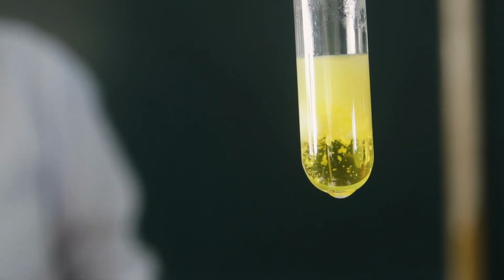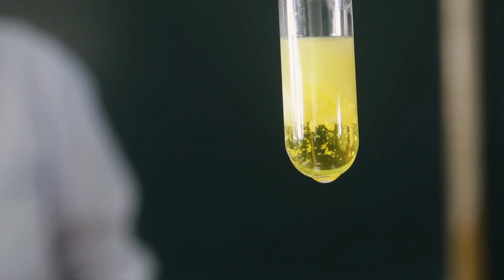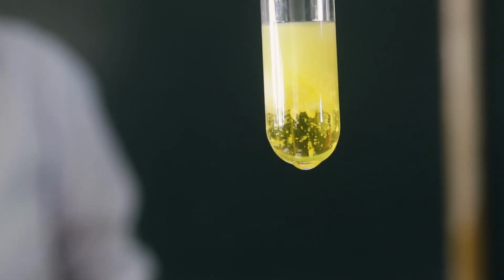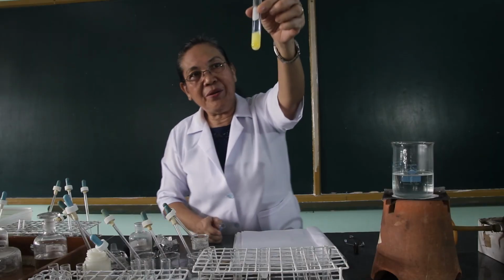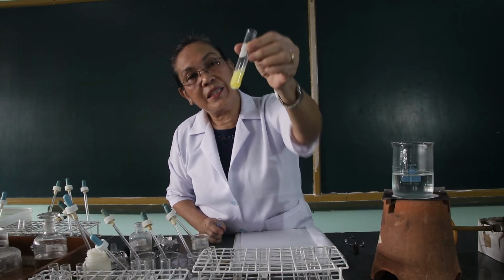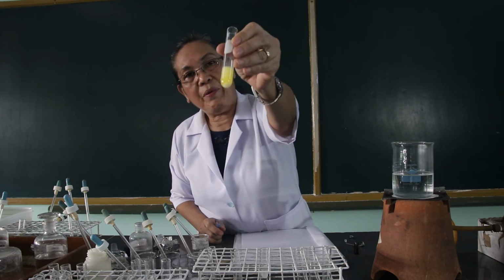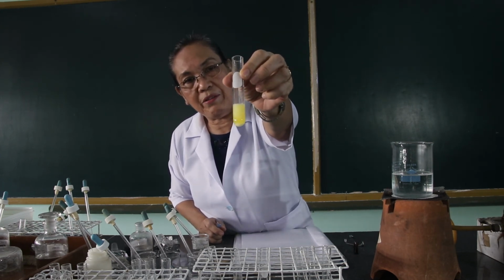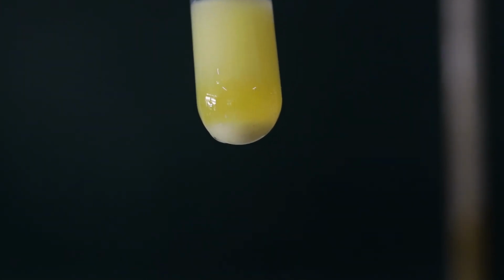So the calcium added with the ethyl alcohol, then heated over the water bath, and added with ammonium oxalate. This is the result. So this is the precipitate formed at the bottom. I want you to observe the precipitate formed at the bottom, and we're going to decant this solution.